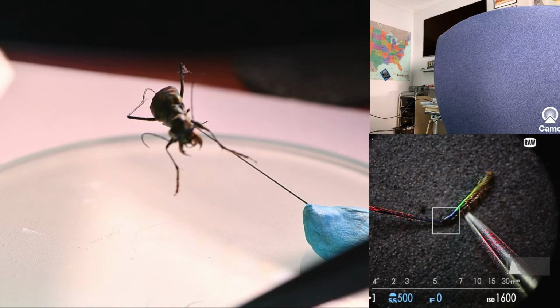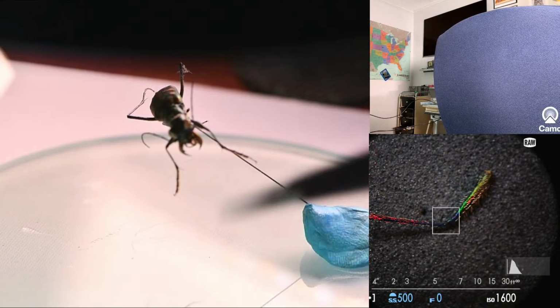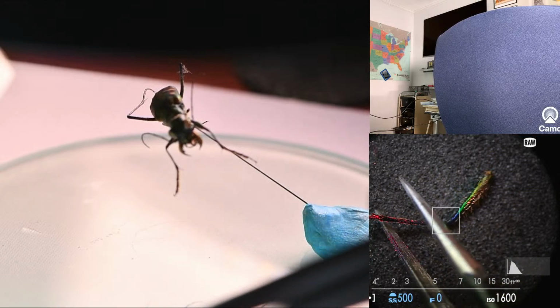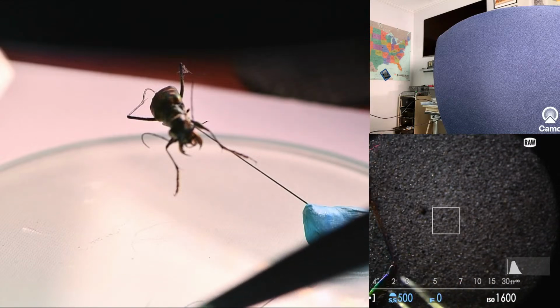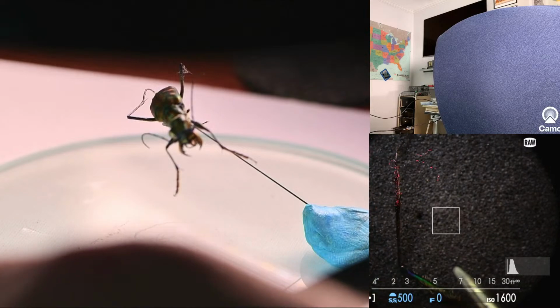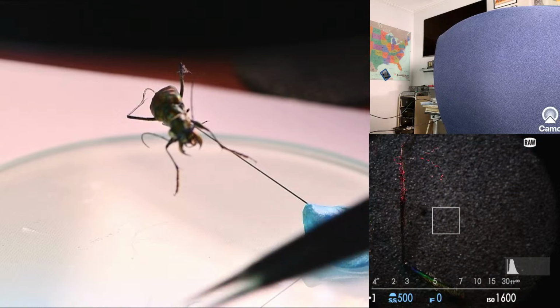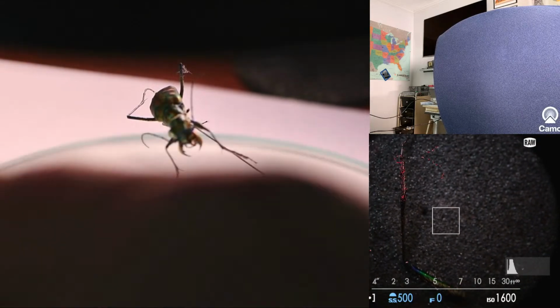First of all, it has two distinct sides. It has an outside that will face the outside of the insect. It's what we'll see, and it has an inside. And we want to make absolutely sure that we put it back on in a way that is consistent with the other side. So we have to examine the bug on the other side, make sure that the appendage is going to look right when it goes back on.